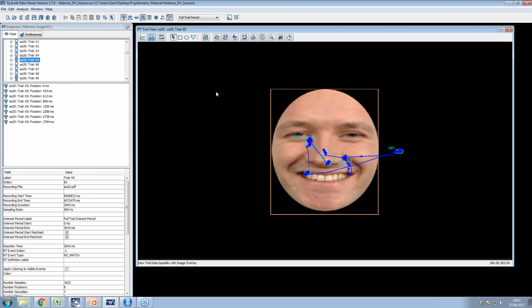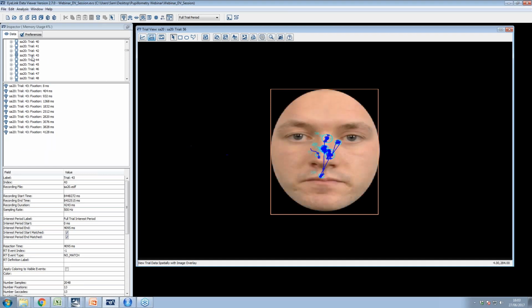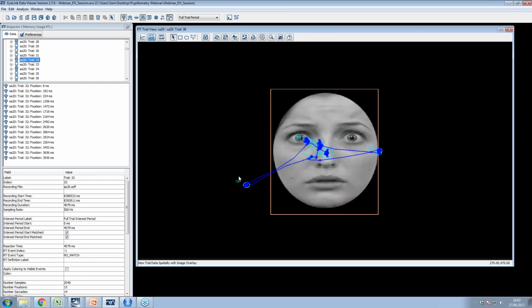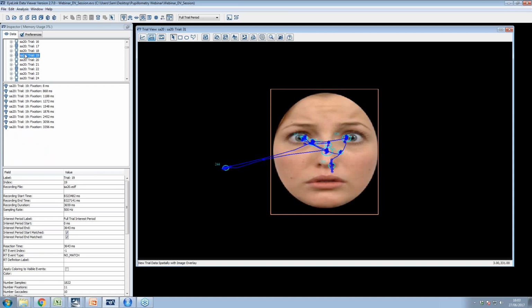And you can see that whilst gaze is generally relatively restricted, these aren't full screen stimuli by any means, they're relatively small and central, and therefore any impact of the pupil foreshortening effect is going to be very, very minimal, given these sorts of movements around the face itself. You do occasionally get people glancing off to the side, and this is something that we may want to take into account, because if glancing off to the side happens to artificially result in a dramatic increase or decrease in pupil size, we might want to know that that's what's happened in this case.